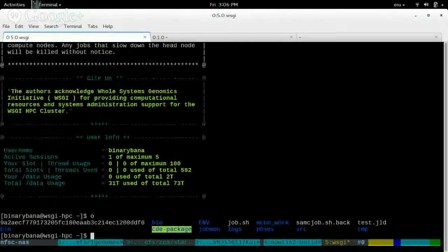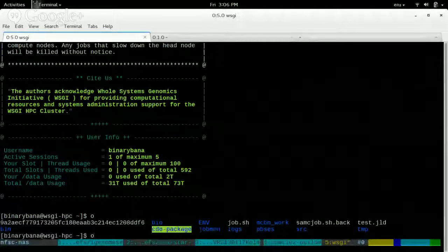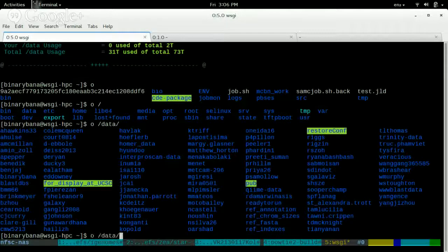Yeah, so on here, since everybody's doing genomics on this cluster, he has some shared resources like reference genome indexes. So you may not even have to build some of these. Like he may have a maize one. Maybe not for maize because it's not as common. Where would those be?